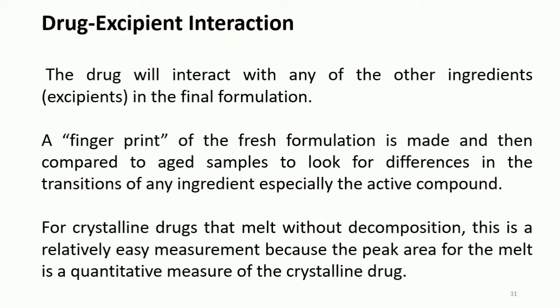Differential scanning calorimetry has proven to be an excellent tool for detecting drug excipient interaction. A fingerprint of a fresh formulation is made and then compared to the aged sample to look for differences in the transitions of any ingredient, especially the active compound.